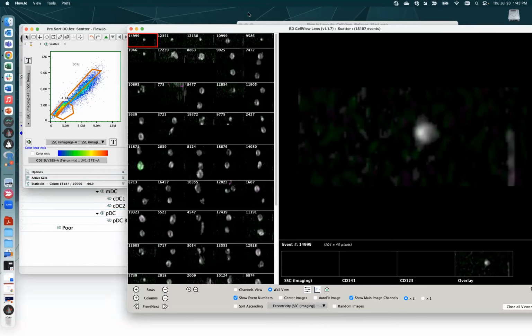Okay, we have a question. I understand the images are not RAWs, but in fact preset from Cytek. The filter settings are just to adjust better afterwards. It needs, so probably no need to adjust after recording. Everything needs to be settled online, I think.